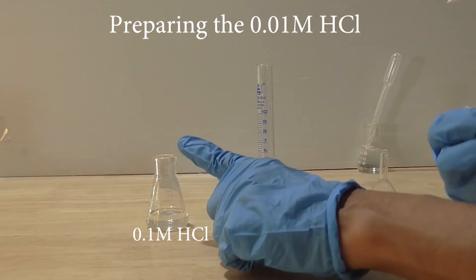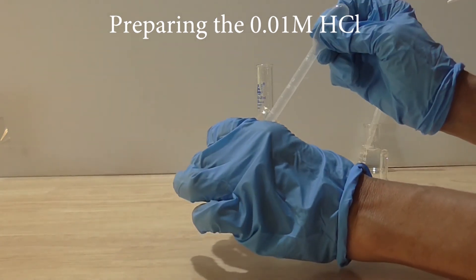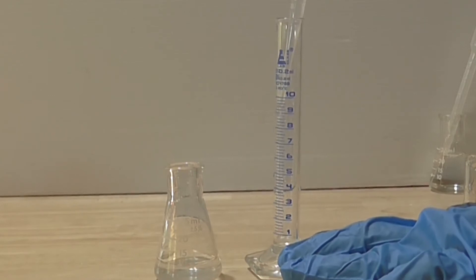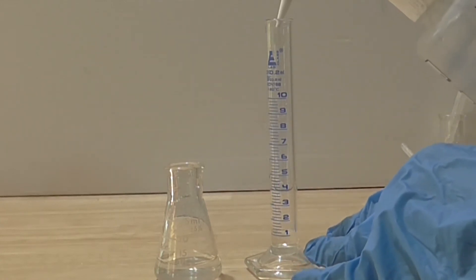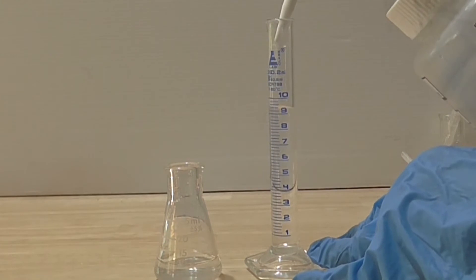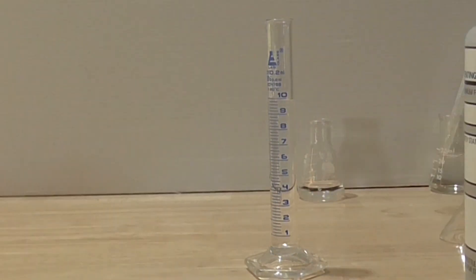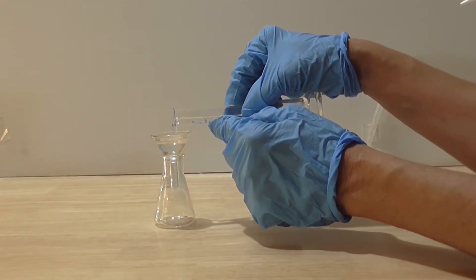I will now pipette in the standard volume of 1 ml of the 0.1 molar acid into the cylinder. Then I squirt in 9 ml of water into the measuring cylinder. The total volume of the acid and water is 10 ml. The dilution factor is 10. Therefore, the concentration of my newly prepared acid is 1 tenth of 0.1 molar, making it 0.01 molar. I can now transfer this 0.01 molar acid into a clean, dry glass flask.